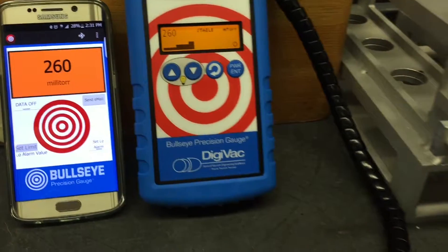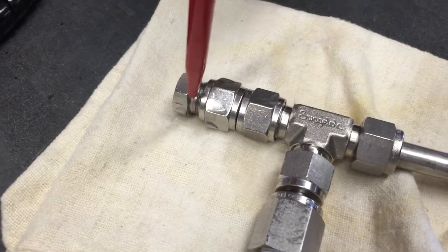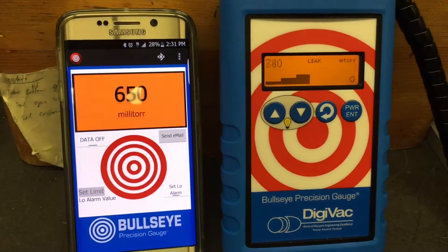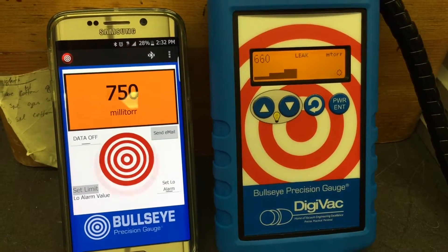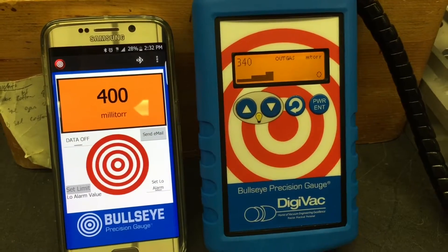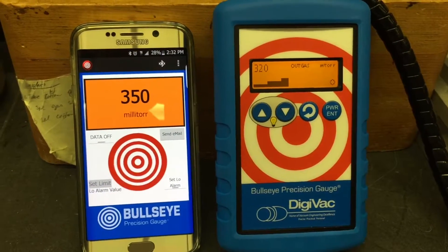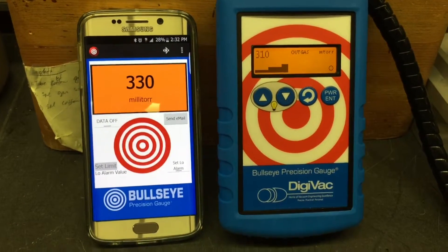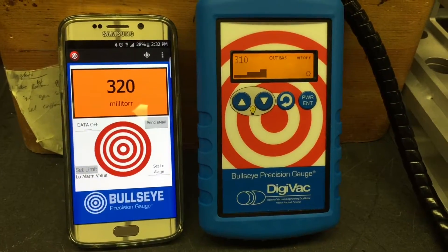Now we're going to the part that I loosened up a little bit. You can see that it's increasing by a few hundred millitorr, and now it's going back down. Now we know that there's a leak at that point.